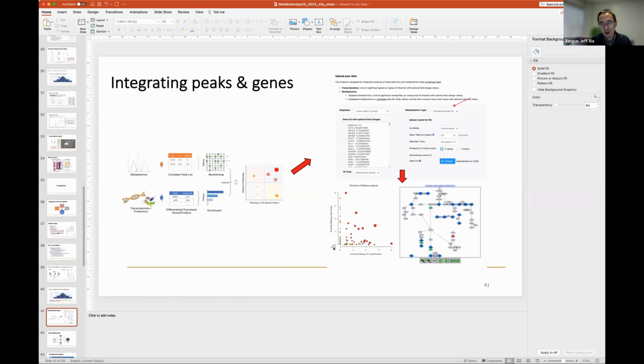Overall, the exposure will hopefully perturb some pathways detected by transcriptomics, and perturb some pathways detected by metabolomics, and not necessarily will they agree. But if they are really in the diagonal part, they will agree with each other. If they don't, it's basically either a time difference, you didn't collect in a stable state, or something like that. So for integration of untargeted data with other omics, you can use this.